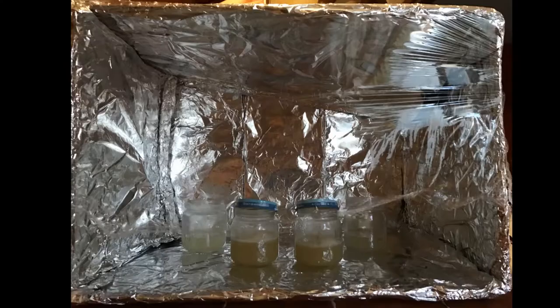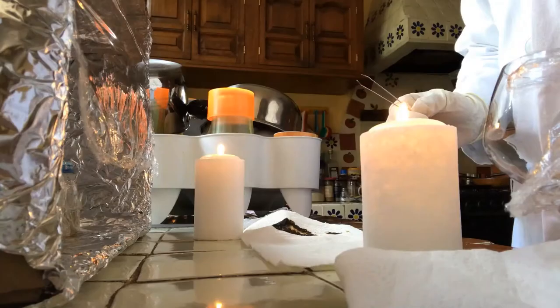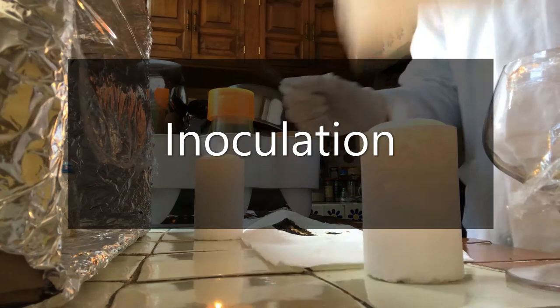As a laminar hood, I used a box with aluminum paper and a plastic sheet. Everything is sterilized with alcohol. The candles were useful to create an aseptic zone.